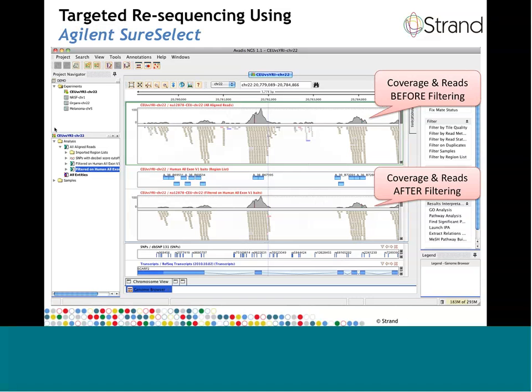One of the most common workflows for SNP detection is to use the Agilent SureSelect target enrichment approach and perform targeted resequencing. Targeted resequencing allows you to focus your sequencing power and, more importantly, money on a small and targeted region of the genome, very often the exon regions of the genes. This can reduce the cost of a sequencing run substantially and allow you to focus on those important areas and limit the number of false positives that will need to be followed up.